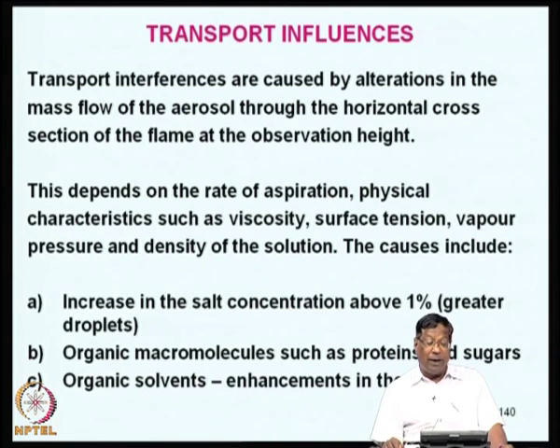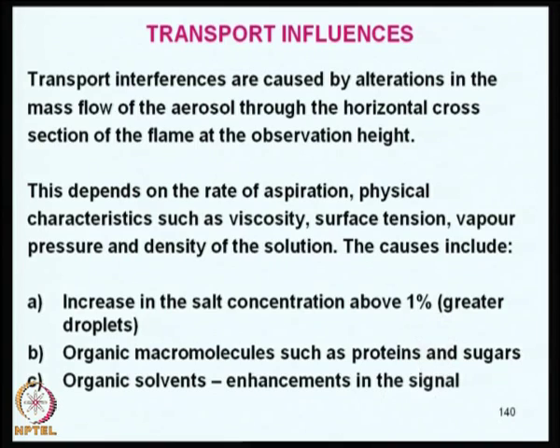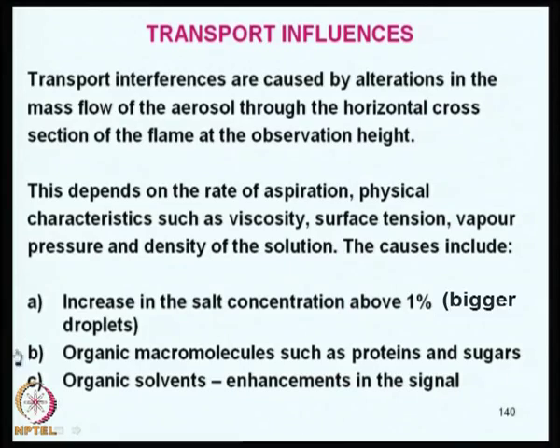Sometimes you may have organic macromolecules such as proteins and sugars, and these also will influence your absorbance. Organic solvents usually burn in the flame, isn't it?